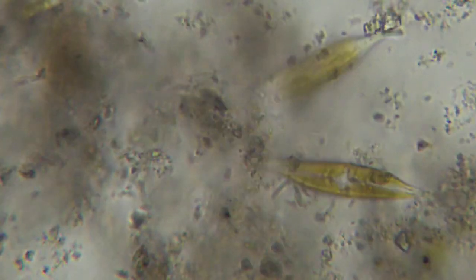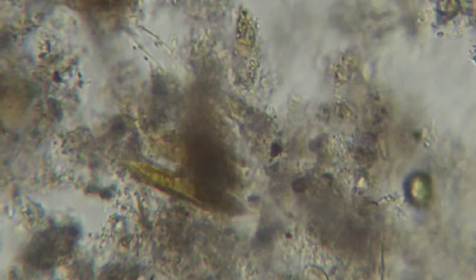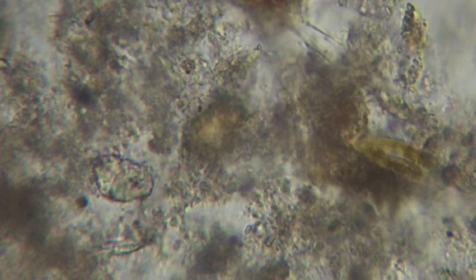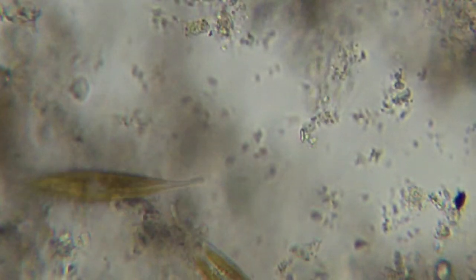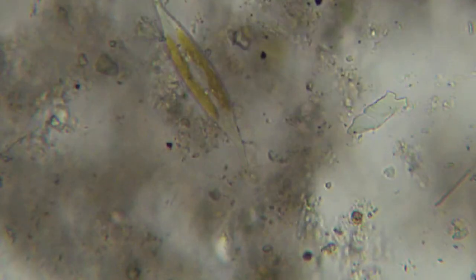And the long tapered ends that are kind of bent in different directions. I forgot what kind this is, but they're really cool. Some of the biggest diatoms in the area. Let's see how they have to navigate through all this muck. Which is basically what they're doing in the mud, right? They're just either on top of the mud or in the mud, navigating to get to a spot where they can get to the light. That's a nice view of one right there.